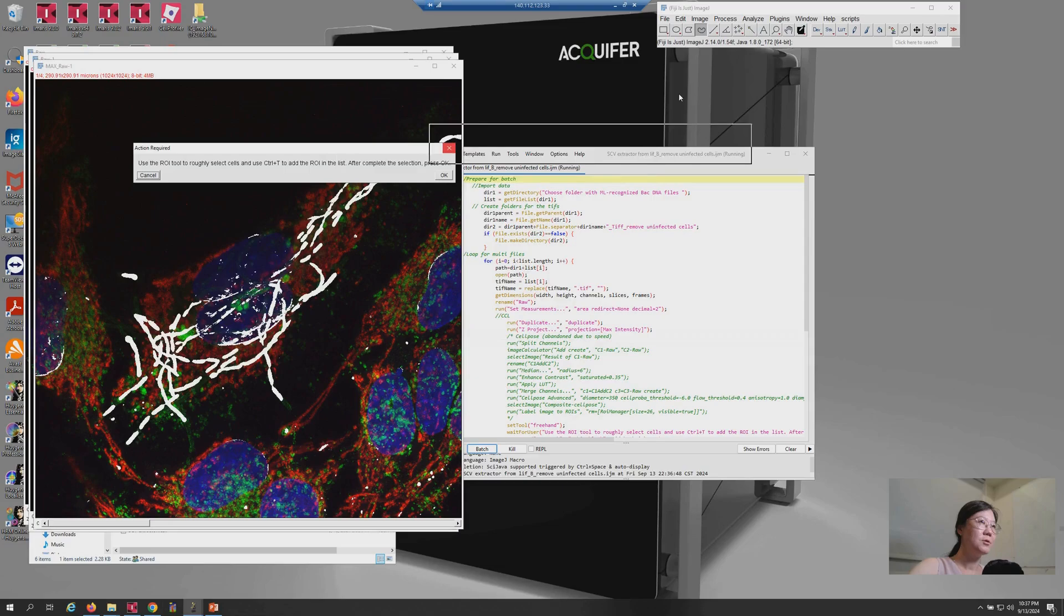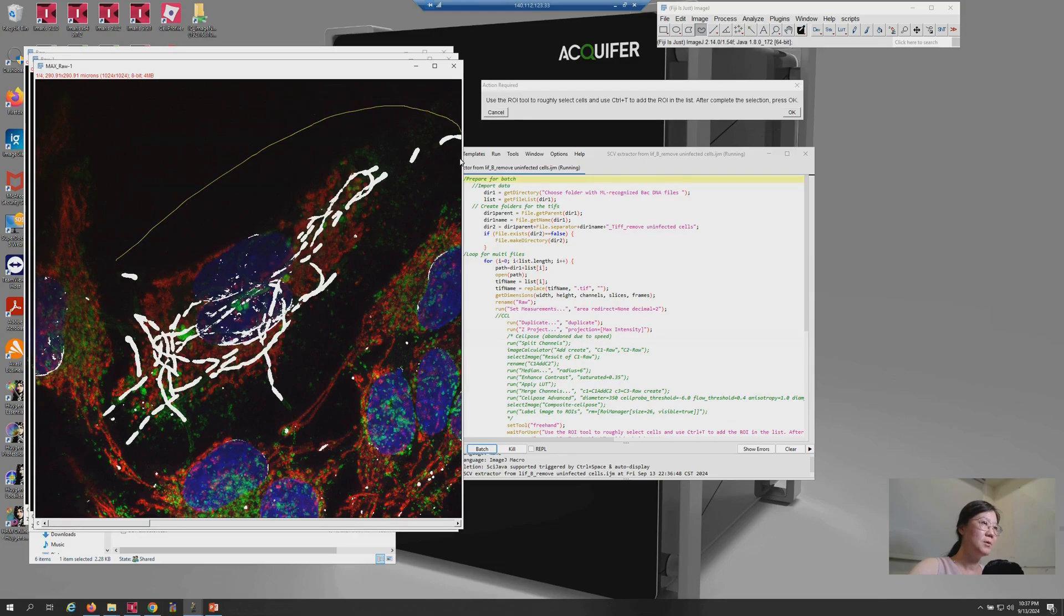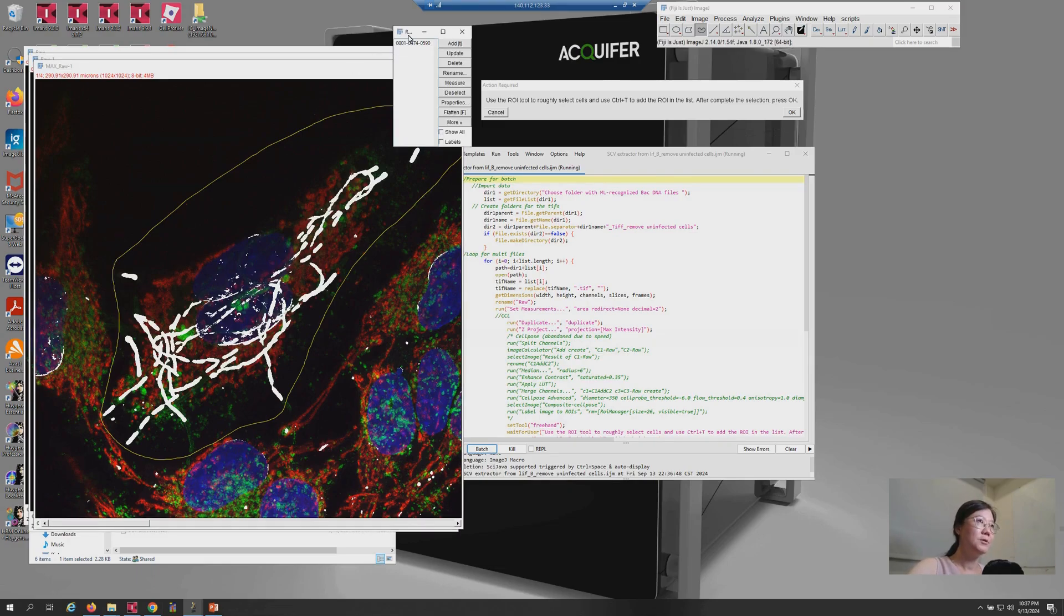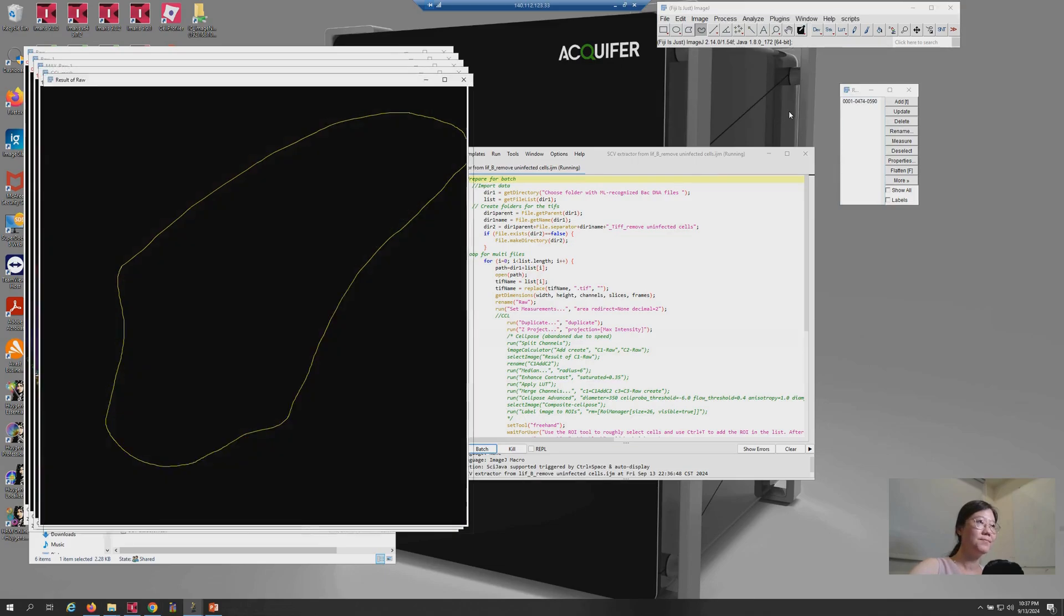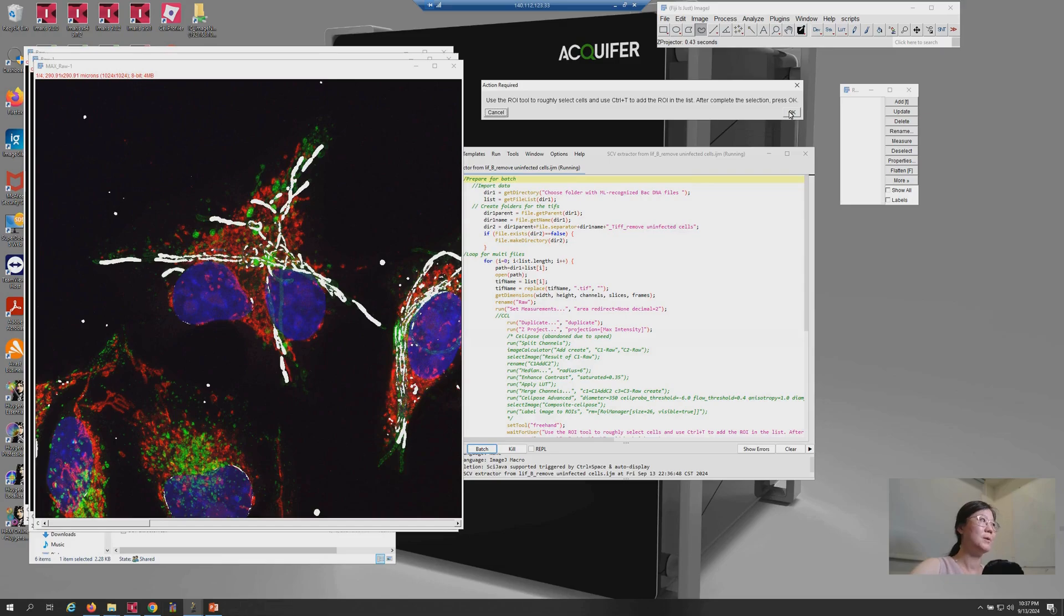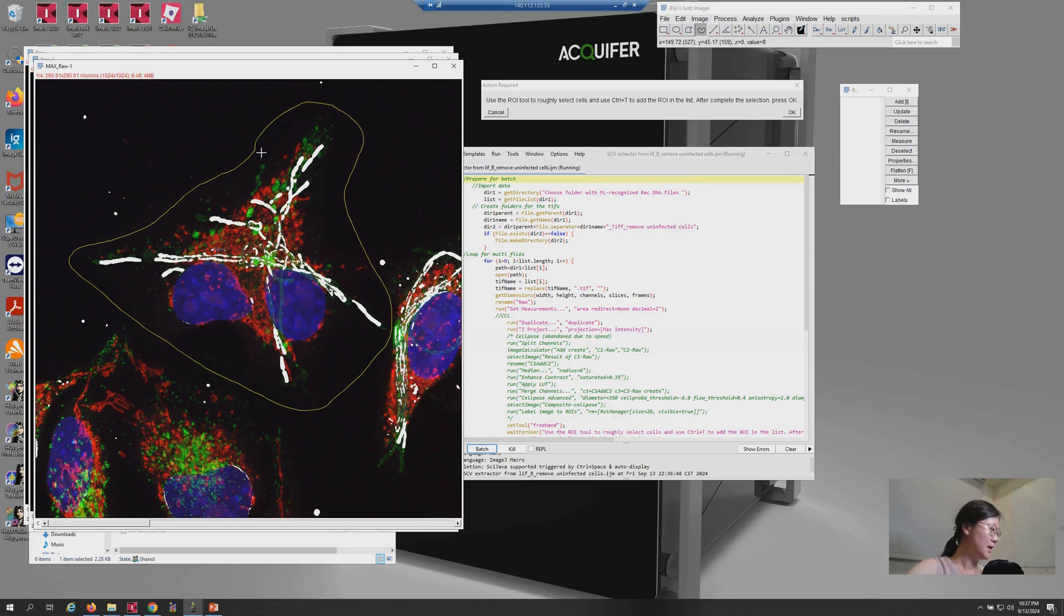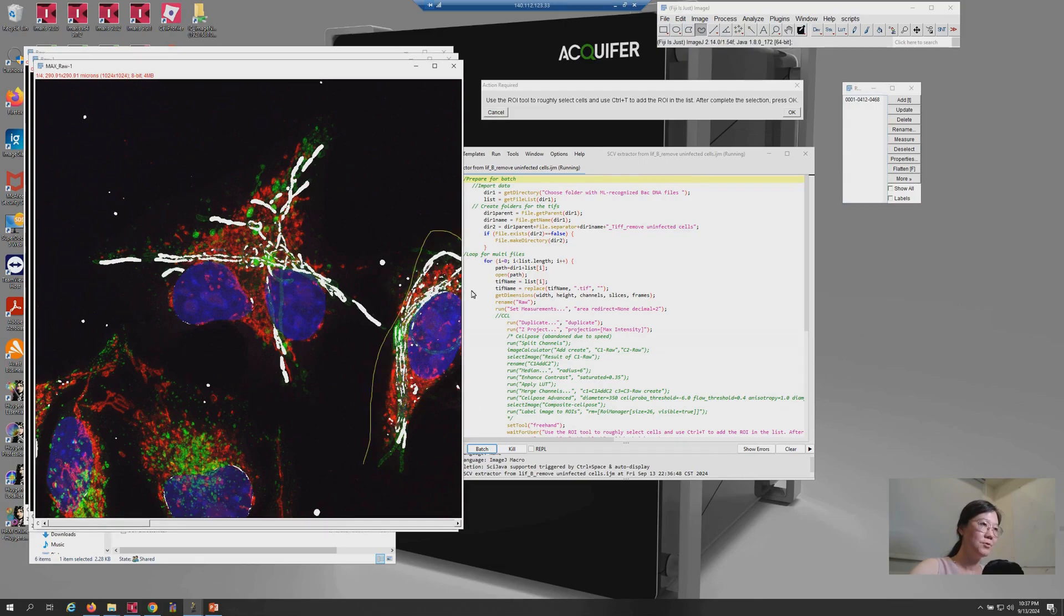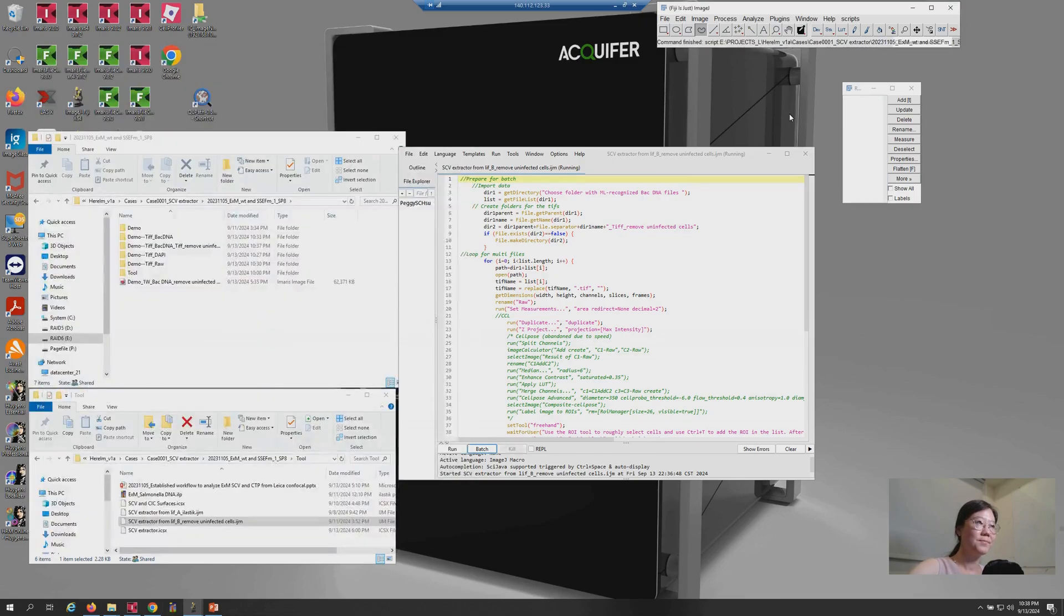So, here the image will pop out. And you can use tools. For example, I want to keep this one. And then press Ctrl T in order to save this ROI in the ROI manager. And you can press OK. Then the next image will pop out. So, you just do the same thing. Use the tools here and try to select the region. And use Ctrl T to add this region into the ROI list. And here is the second cell I want to keep. So, just do it. And press Ctrl T. Then press OK.